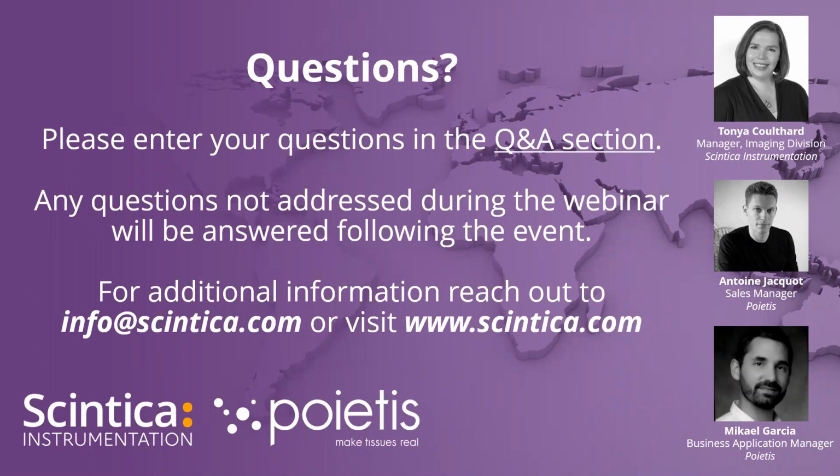Perfect. We've got just a couple minutes left. If there's any remaining questions that people in attendance still have, feel free to enter them in the Q&A dialog box. There is one left, and it relates back to when you were talking about viewprint, and you were showing how different wells could be selected and then have the cells printed within. Is there any way to automate that process and have it be more software-based, removing the inaccuracy of the human side of things? And if I can add to that, perhaps we can talk about it with respect to wells that you are planning to be printed, as well as wells that are on, for example, the electrode array plate that you were talking about towards the end, Antoine.